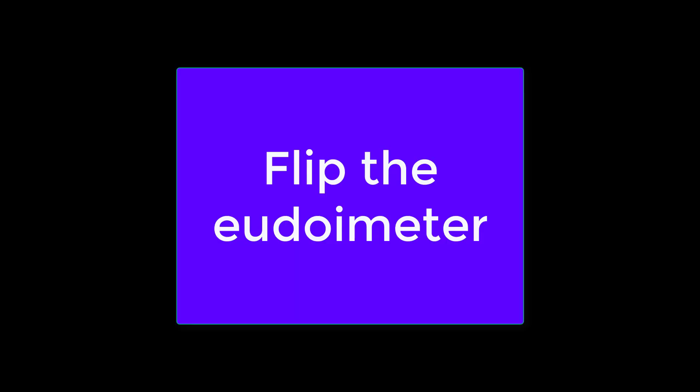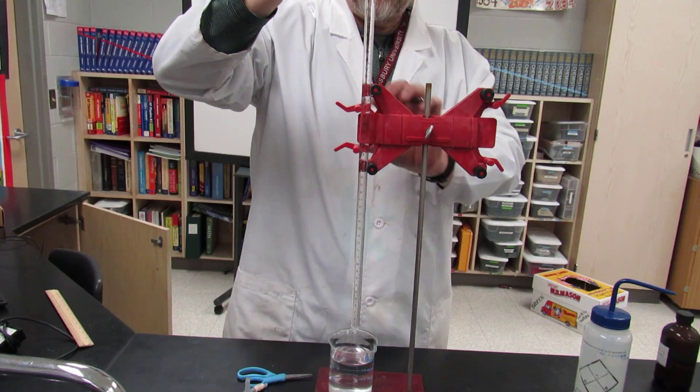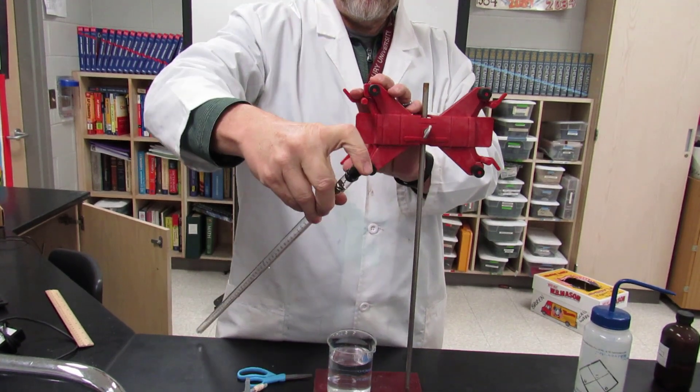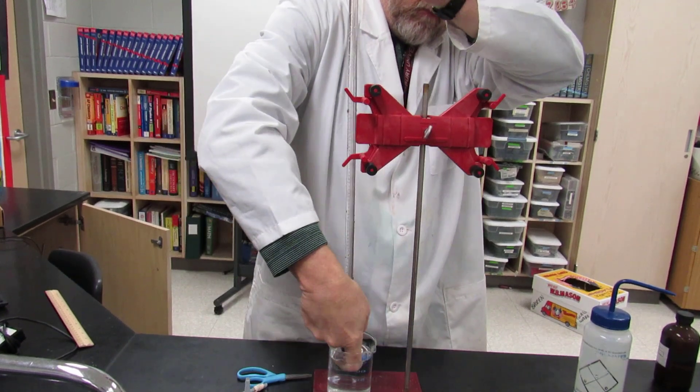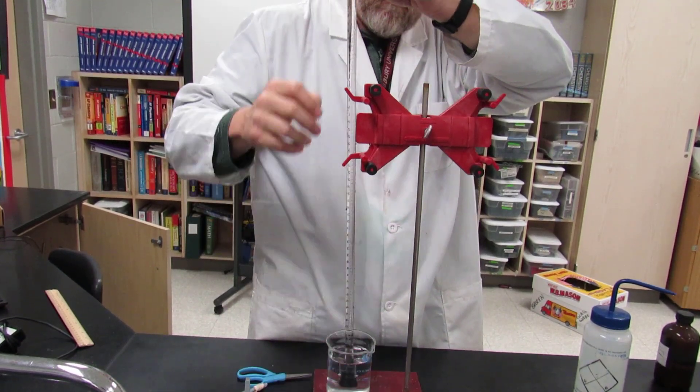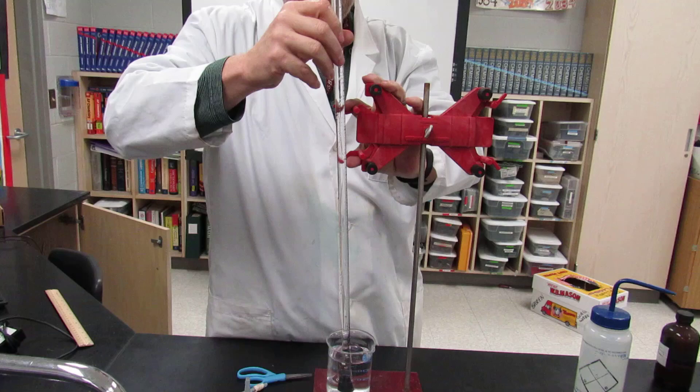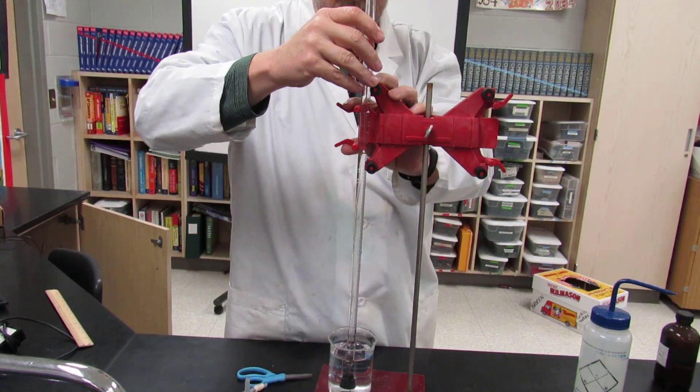Press it on, not too hard, enough that it's going to stay in there. Now take your finger and put it over the hole at the top, and then flip the eudiometer over keeping your finger on the hole. Put the eudiometer top into the water. Once it's in the water you can remove your finger and clamp it into the ring stand.